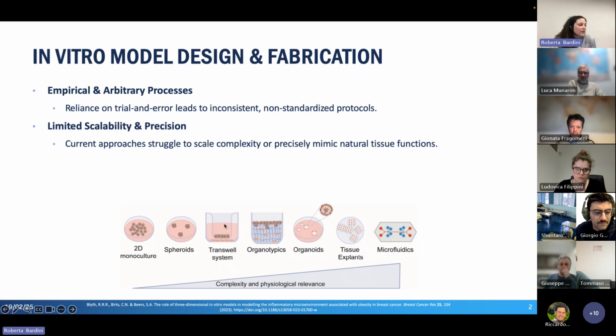If we stick with the microwell, transwell-based co-culture that Giorgia was mentioning, the mere size of the pores can affect which kind of phenomena I'm going to observe in my system. For example, if the pores are less than 0.5 micrometers, cells won't move across the pores. If I want to study chemotaxis, I need larger pores.